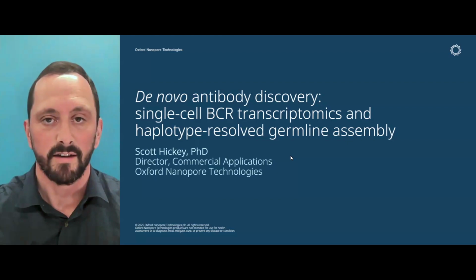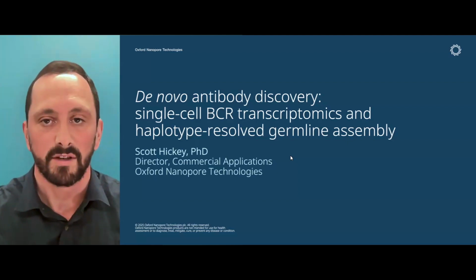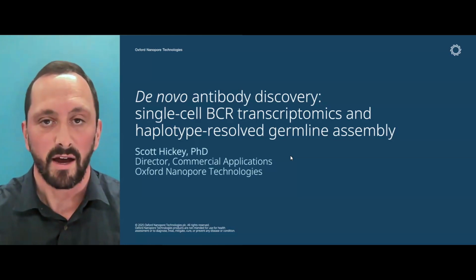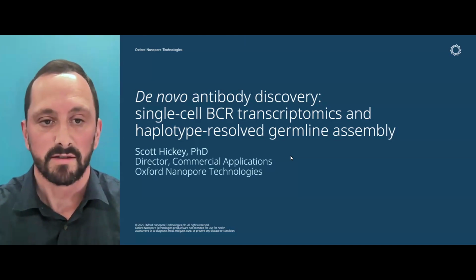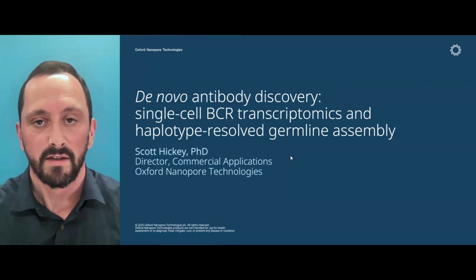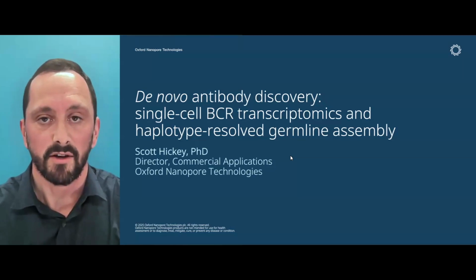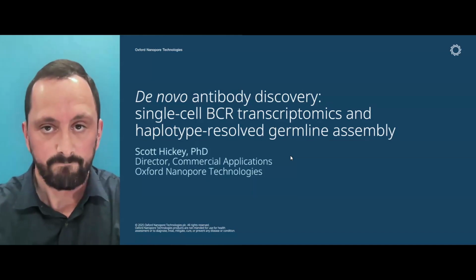Thanks so much, Shayanika. Hi, my name is Scott Hickey. I'm Director of Commercial Applications, and today I'm going to talk to you about a project that we have related to antibody sequencing. And this is a multiomics project sequencing both at the single cell level to get the single cell B cell receptor transcripts, and then also a germline haplotype resolved assembly of the B cell receptor.